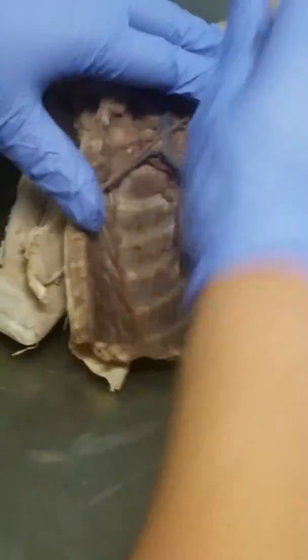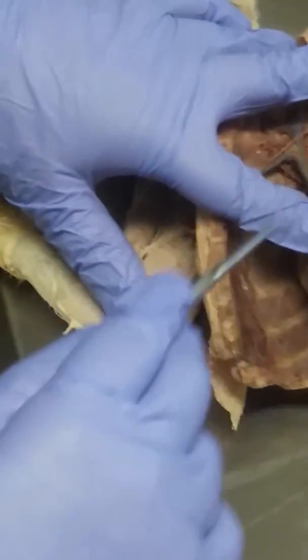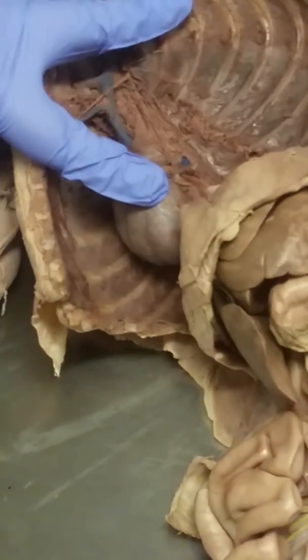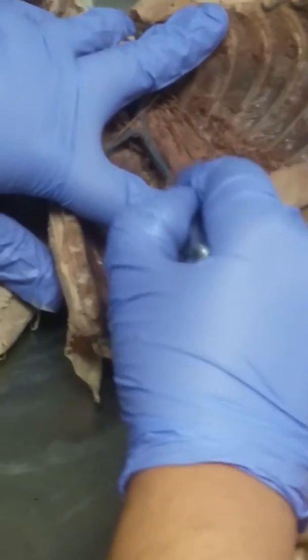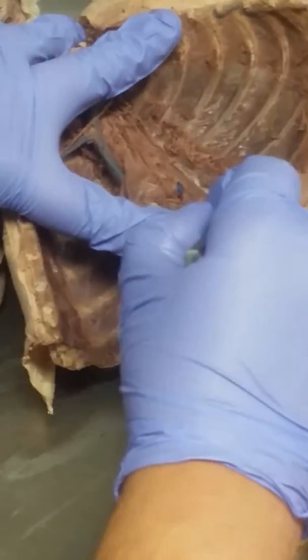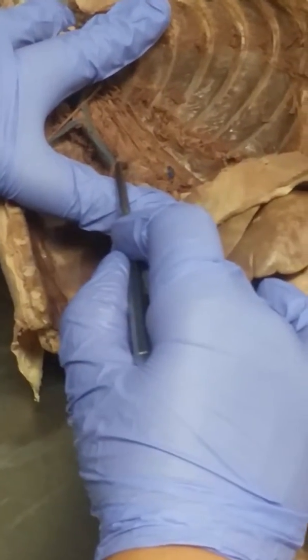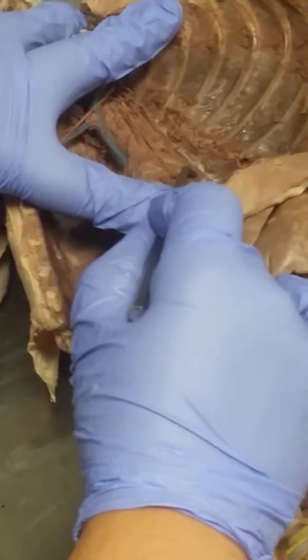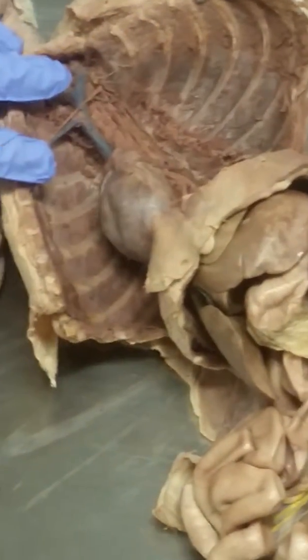Now, on the cat, if we look at the aorta, you'll see how many vessels coming off of it. Do you know that the aorta is divided into regions? You can stand on the table to get a better look. You sure? All right. So, the aorta is going to go like this, right? So, you have the ascending portion of the aortic arch. You have the aortic arch, and then you have the descending portion of the aorta, and then you got the thoracic aorta, and then the abdominal aorta, right?